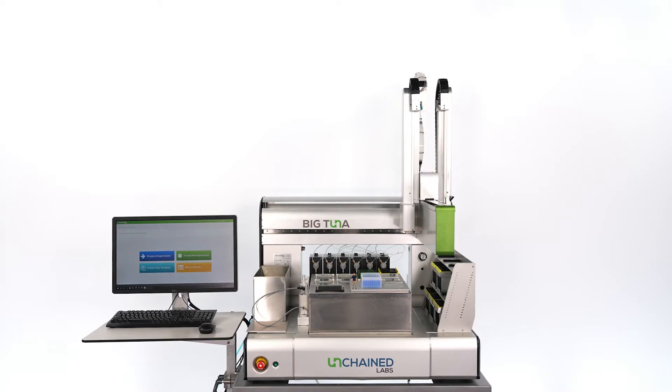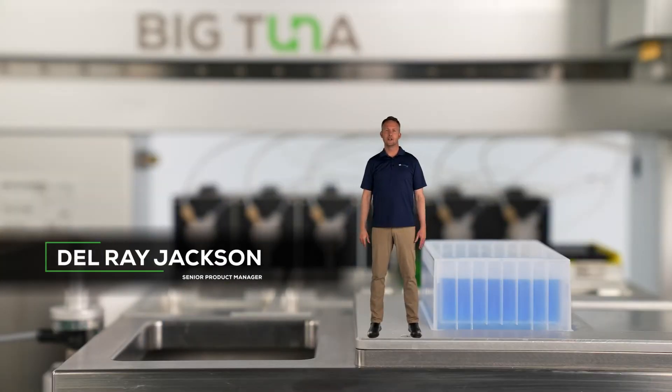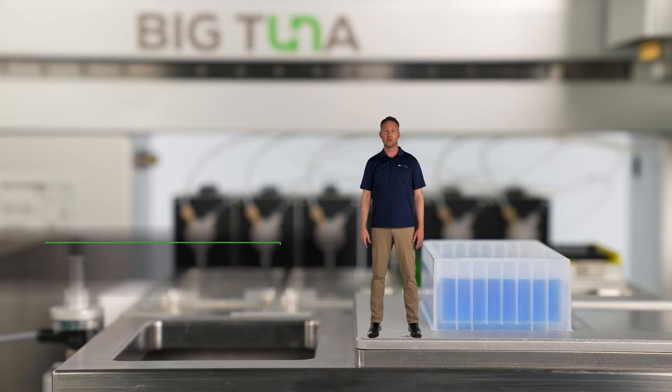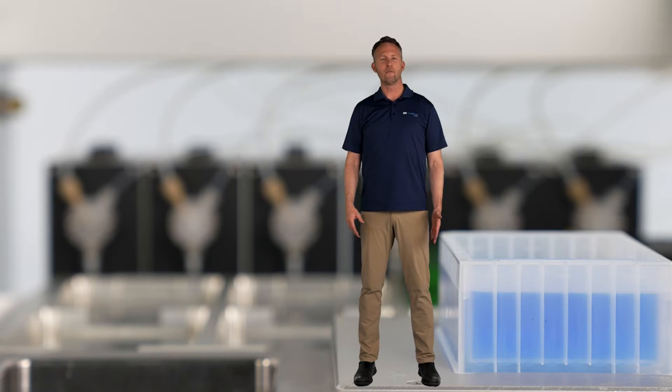Hi, I'm Del. Today I'd like to show you how Big Tuna can take on the tedious chore of Buffer Exchange, so you can be free to do other stuff. Big Tuna is a fully automated Buffer Exchange and Concentration platform.